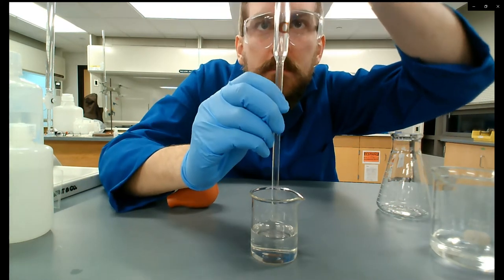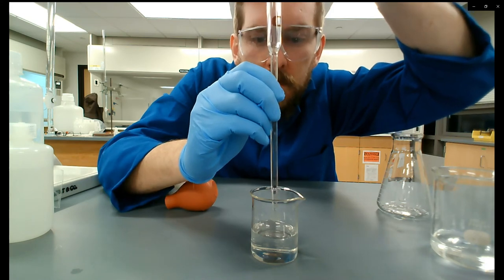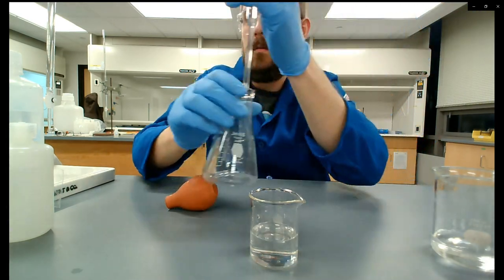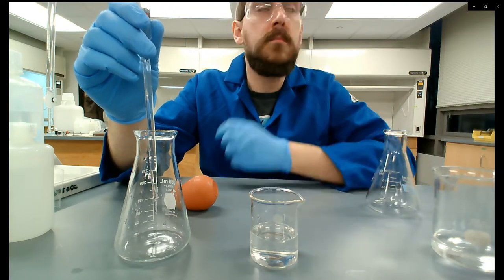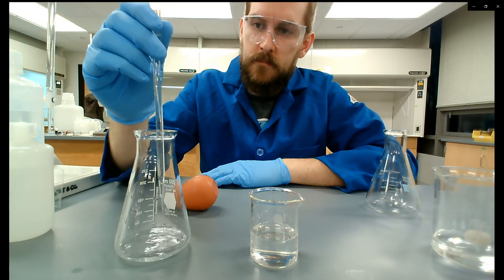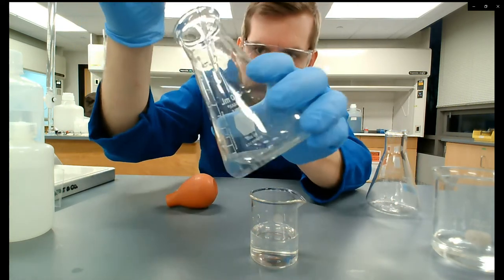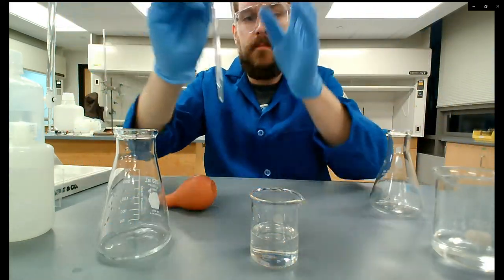Pull it out of the liquid, then slowly release my finger until the meniscus gets to the bottom of that line. Tap off any dispensed drops and transfer into a clean dry Erlenmeyer flask. This takes a while to drain. Notice I'm not forcing it out — I'm not blowing the tip out anymore. Whatever drains naturally is what's being dispensed as 10 milliliters. Tap off any drops hanging at the tip because those have technically been dispensed.